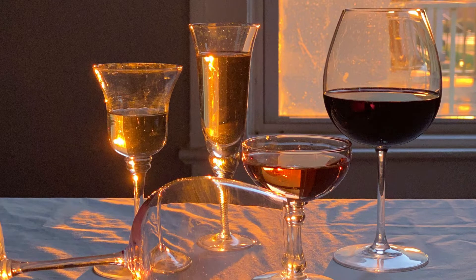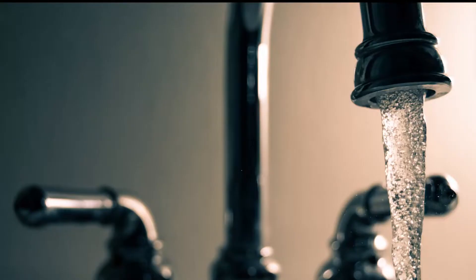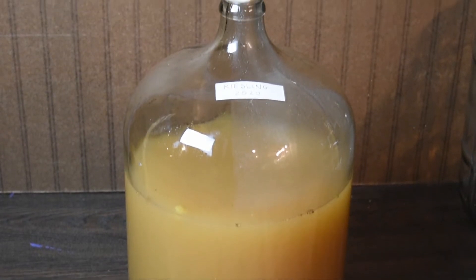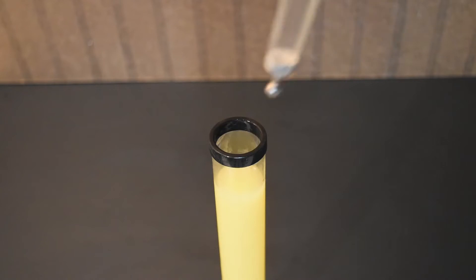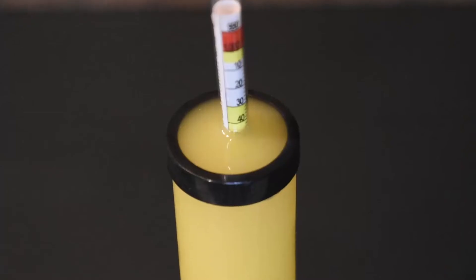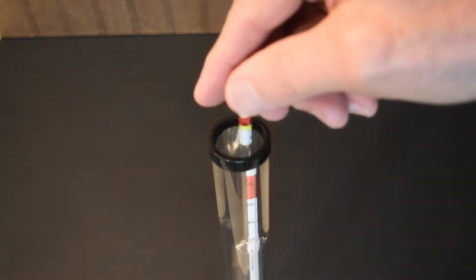Let's start with that family friend: specific gravity. Specific gravity measures the denseness of liquids compared to water. It's expressed as a ratio. Pure water has a specific gravity of one. Fruit juices have a specific gravity higher than one because of their sugars. You can measure specific gravities with a hydrometer. This is distilled water, and the hydrometer reads one.